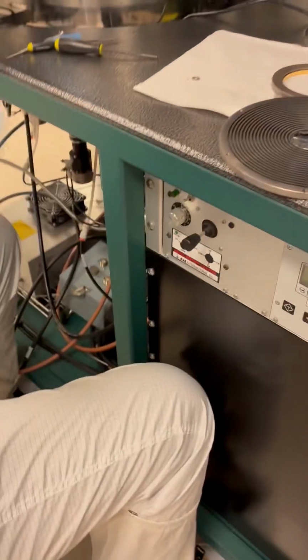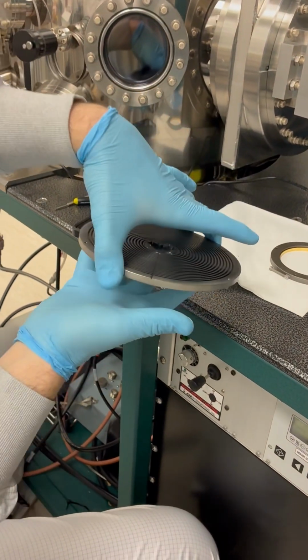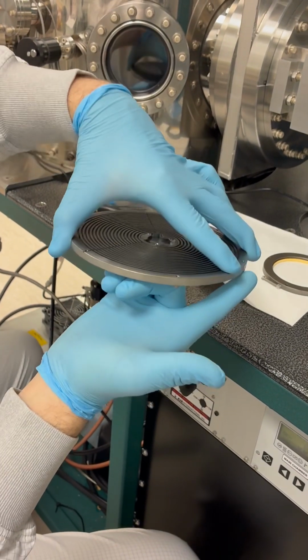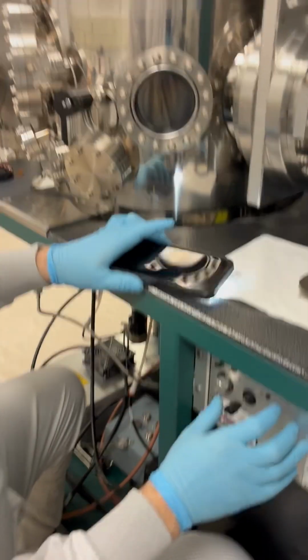And so I saw the transfer arm kind of pick up. What that means is I've been supporting some of the weight here, and this pin hasn't quite lined up with the hole, so it's pushing down on the transfer arm. And then once it lined up, it fell into that hole, and the transfer arm kicked up into position. So now I know I'm in position.